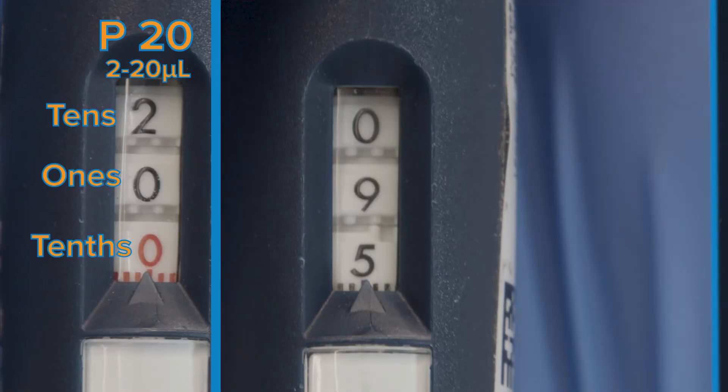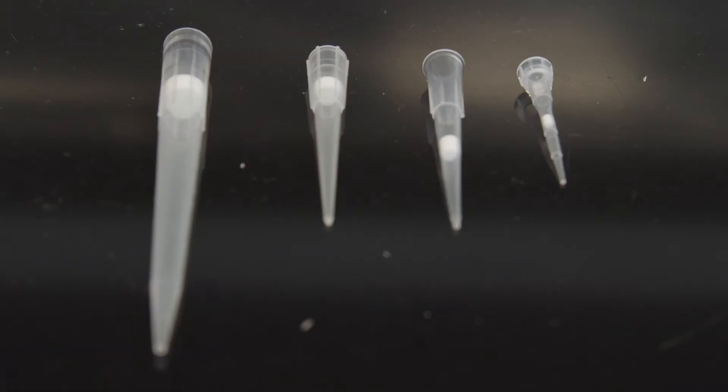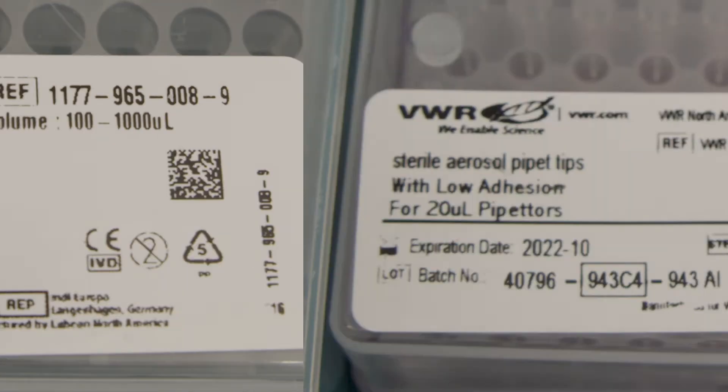The P20, P10, and P2 all follow similar patterns. Keep in mind that this dictates what tips you'll be using. Different tips hold different volumes of liquid. Check the information on the box to find out the volume range for each tip.